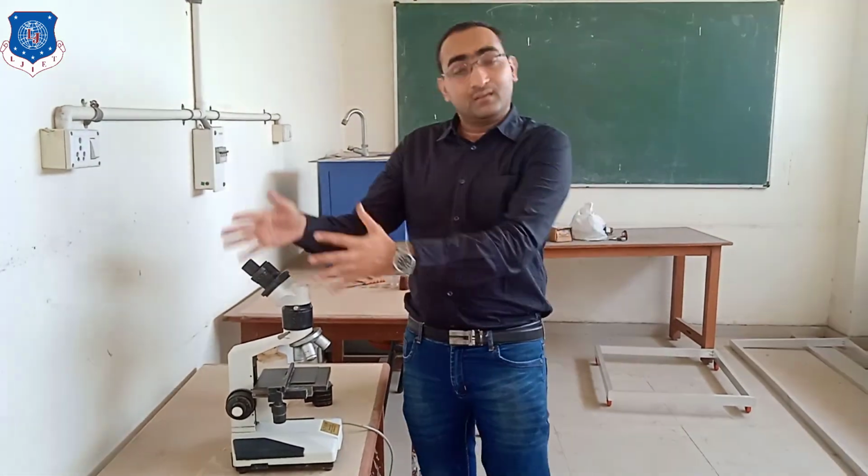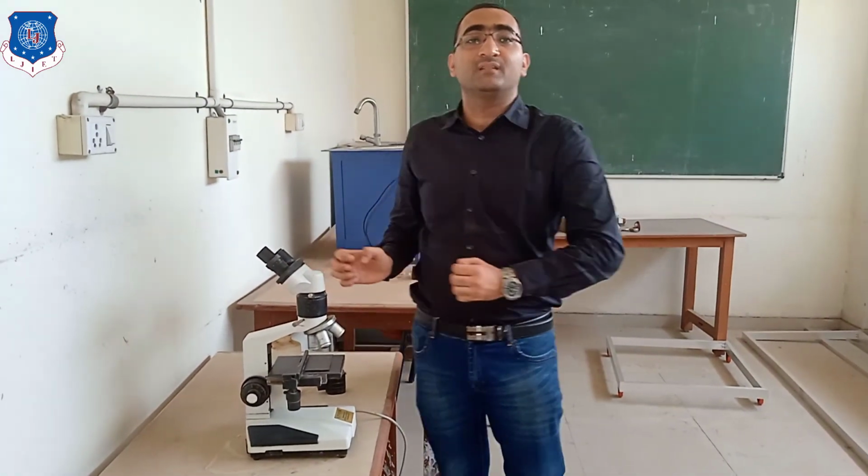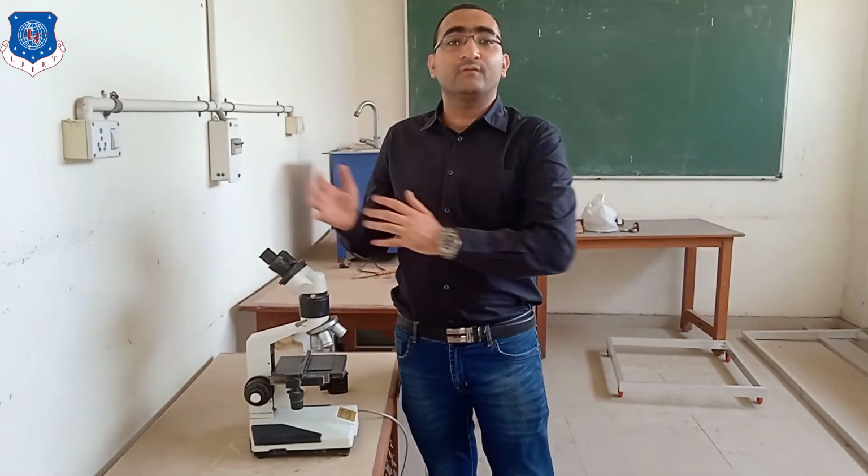So in this way, these are the different parts of the microscope, and as we have studied the working, these are the different parts of the microscope.